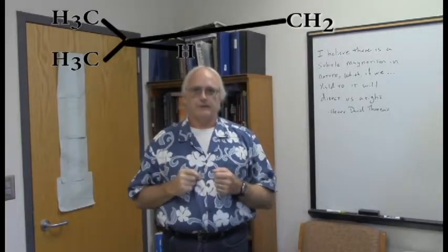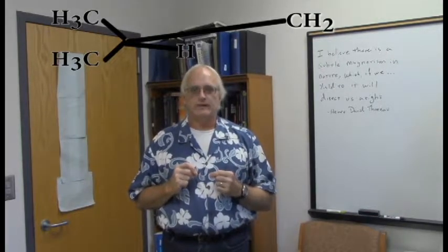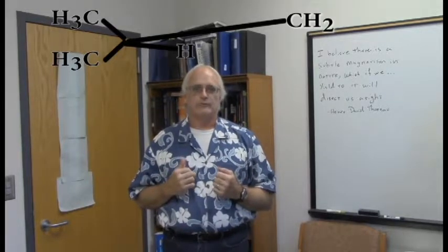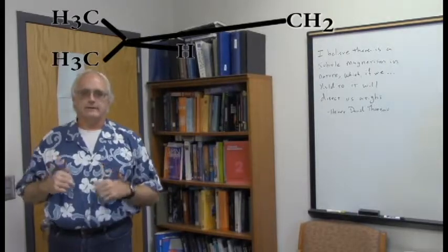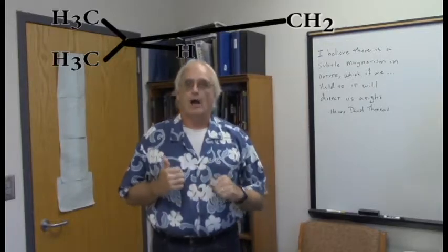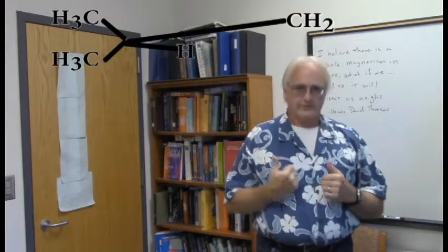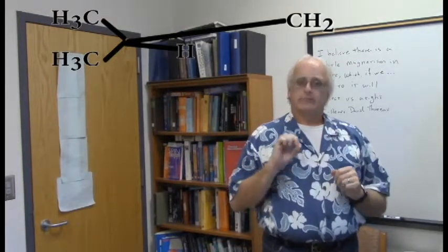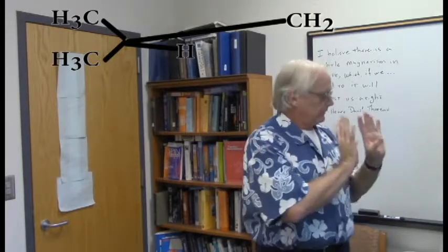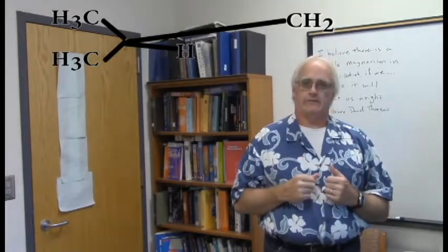And the COSY spectrum is what really keyed us in. There is something interesting here. So what we have is essentially a spin system, is the phrase used, built from 3 groups. The 2 equivalent methyl groups, coupled to the CH group, coupled to the CH2 group. Okay? This is the spin system so far. Now we ask one more question of the COSY. Does the CH2 group have anybody else over here? Can we step one more group into the spin system?